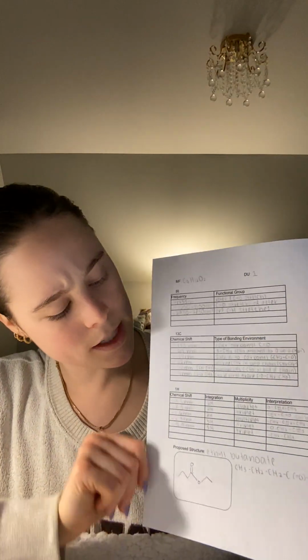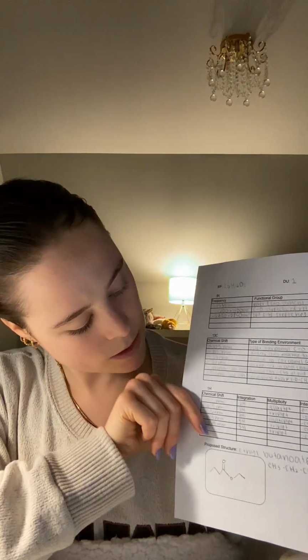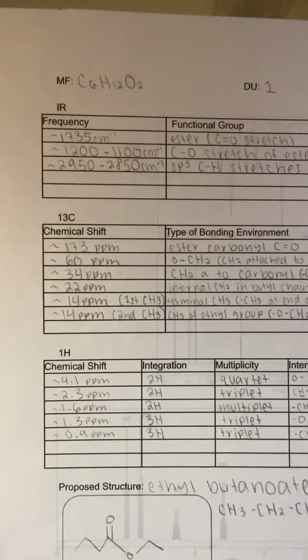So putting all this information together from my 1H NMR table with the formula C6H12O2 and a DU of 1, the only structure that fits this would in fact be ethyl butanoate. So that is my final structure, which I will show you here more closely. I have it drawn here, and then I also wrote out its atoms below. Excuse me, this isn't the molecular formula, it's all the atoms just written out together. But it matches my molecular formula.